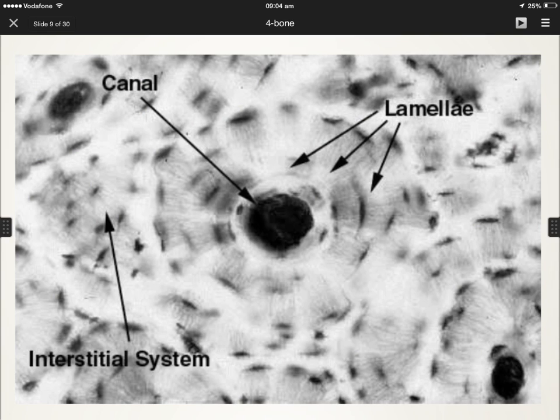Yeah, it's better not to mention the word osteocyte. It is the lacuna. So this is the picture of the ground compact bone. Another picture for the ground compact bone. Of course, this black space is the Haversian canal, and this Haversian canal, and that Haversian canal. These are the concentric bony lamellae showing canaliculi, and this is the interstitial lamellae in between the Haversian systems.